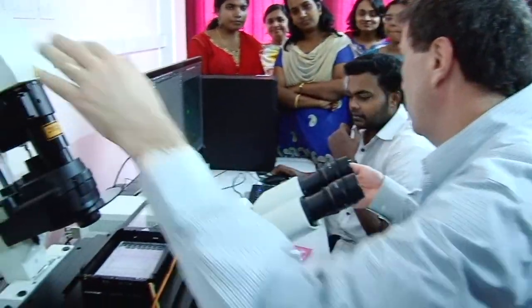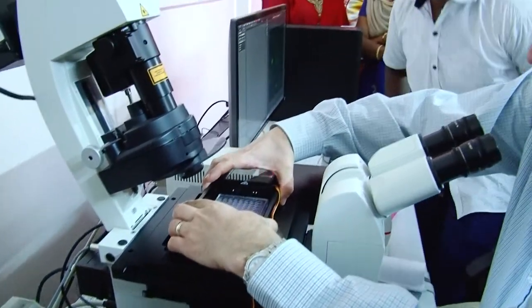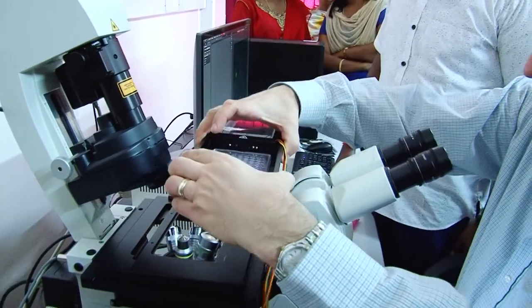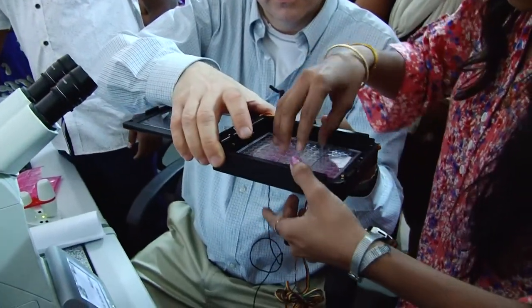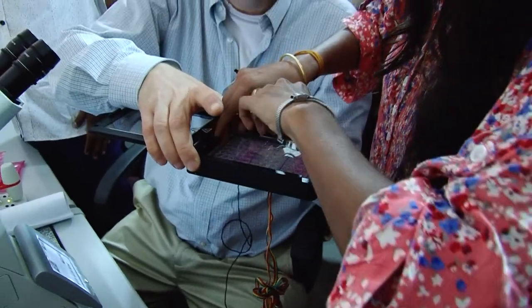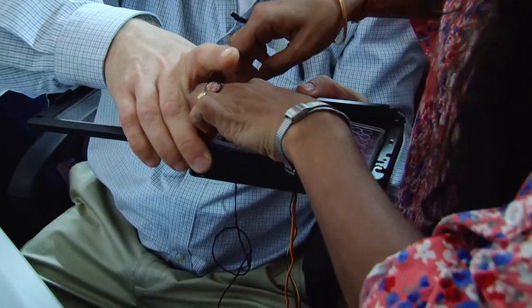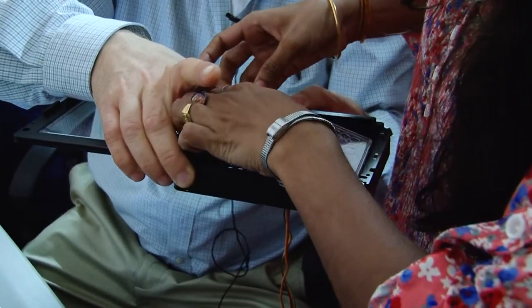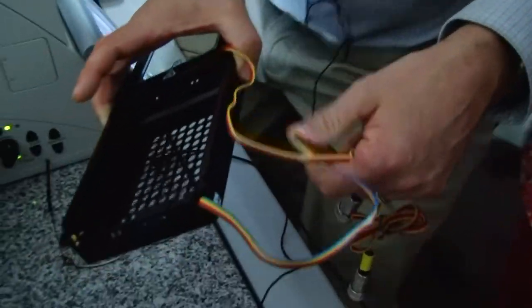So let's put up the slide holder. This just pops out, right? Everybody's got different kinds of holders on their microscope, and I'm not familiar with this one. But here, hold on to this, and let's try taking a look after 5. Just keep them in the dark for the next little bit. Go ahead, Sham, you put up the slide holder.